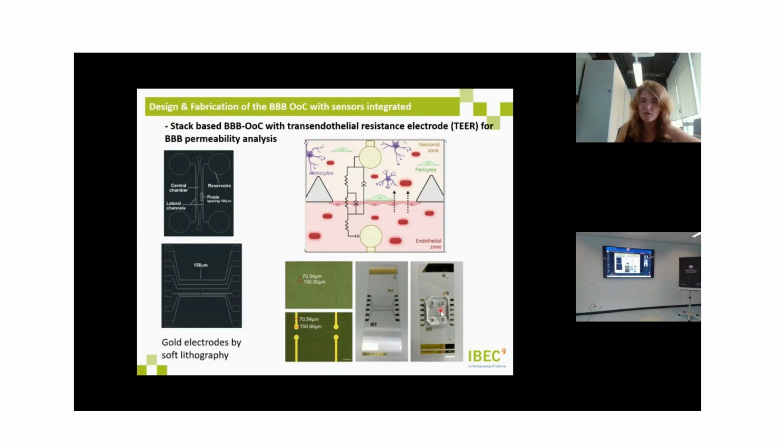So here you can see the integration of the microchannel. That is a micro integration with micro cutting and micro masking for putting in a micrometric orientation both the pattern of the electrodes and the pattern of the fabricated microchannels.